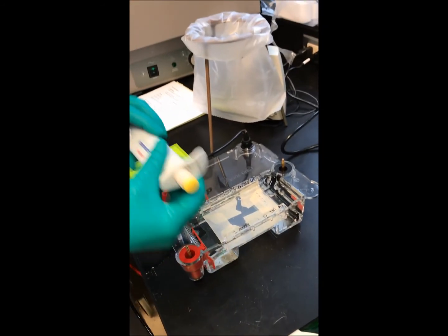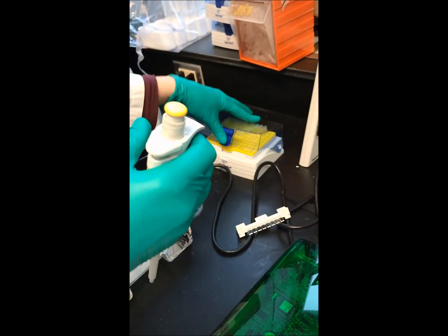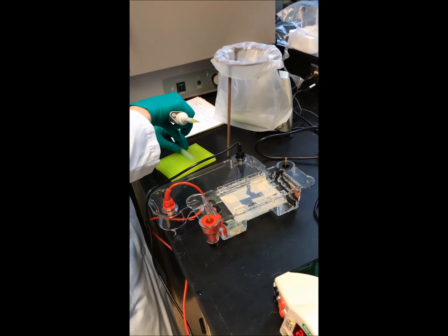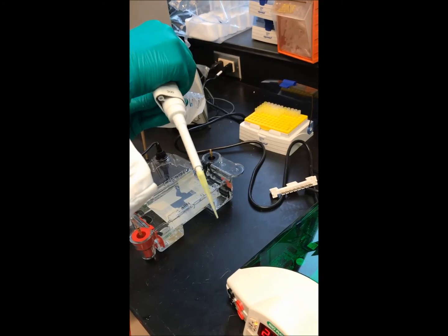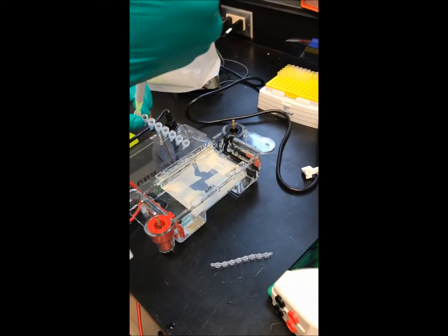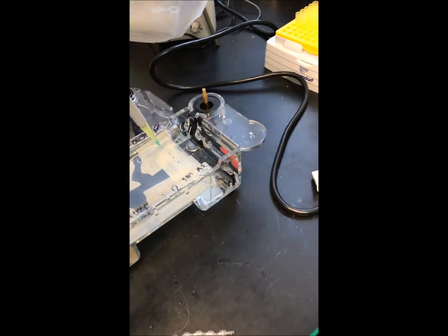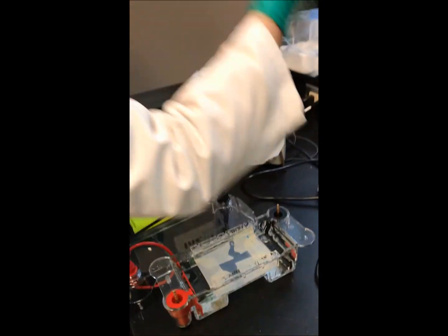Now we're ready to load. I'm going to load 30 microliters, and I'm going to use the pipette tips again and change for every PCR reaction. We don't want to cross-contaminate. So here are my PCR tubes. Remove the caps. Caps gone, the tubes, the reactions, and so I'm going to load from every sample into a specific well. So the first well, well number 1, sample number 1.